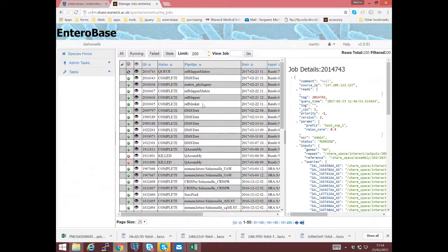So when I created this tree last night, the ref masker job was sent out, and also the ref mapper. We call SNPs based on the actual assembled contigs, not on the short reads themselves. It's not a mapping approach. So the contigs are mapped against the reference, and then any differences, small indels or SNPs, are picked up. This is what happens in the ref mapper.